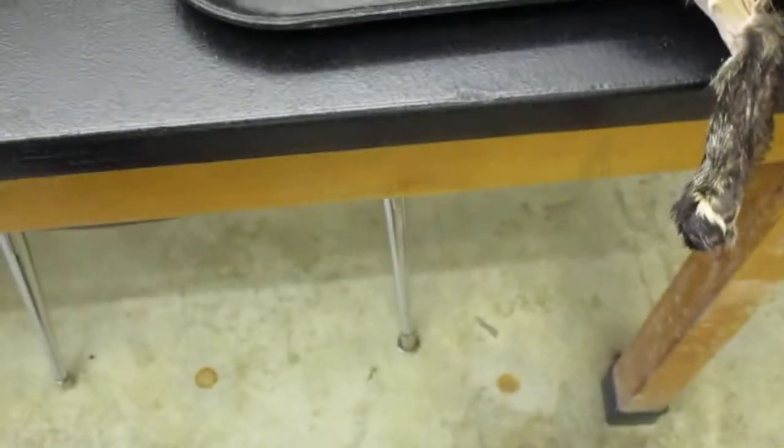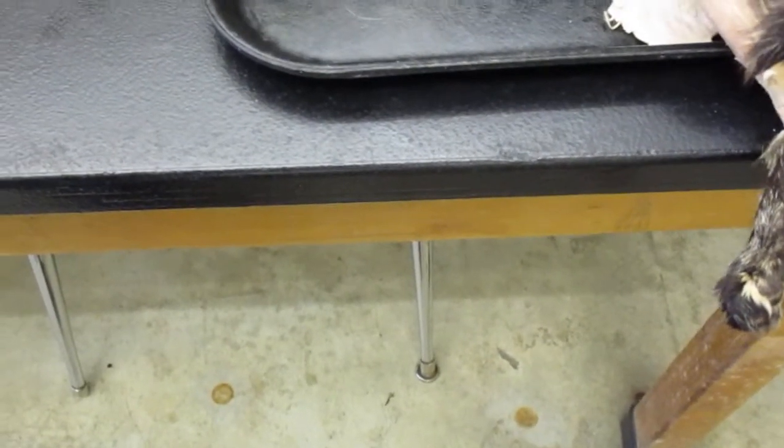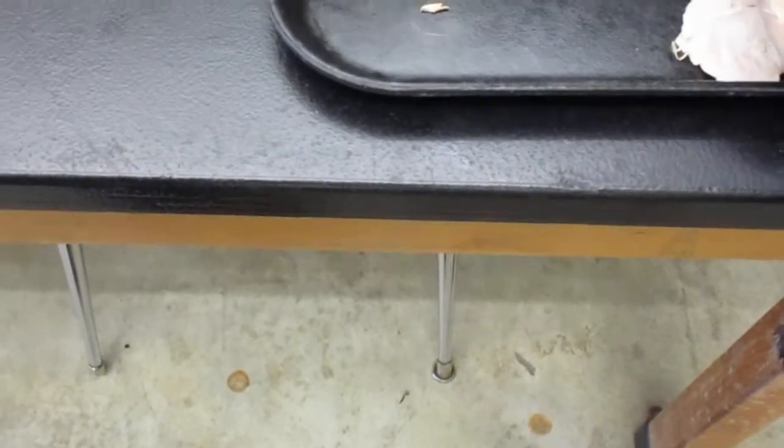And let's see, what else do we have? Let's do the nerves. Let's do this cat. I'm going to go through these nerves real quick.